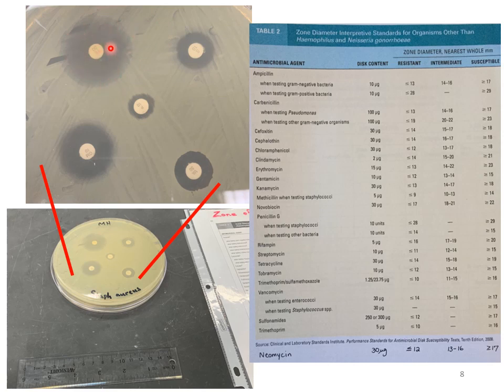So I could say that this sample of Staph aureus is most susceptible to tetracycline, and least susceptible, or most resistant, to penicillin, because I don't even need to measure it to visually see the big circles versus the little ones. So if I was prescribing for a patient from this result, you would want tetracycline or even gentamicin, vancomycin, streptomycin. Any of these would be better than prescribing penicillin to this patient. Okay?